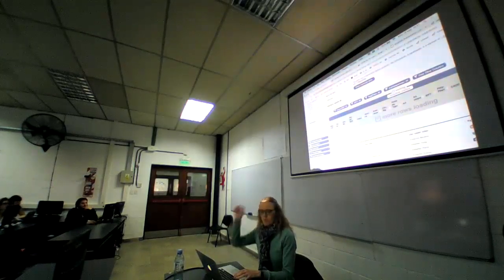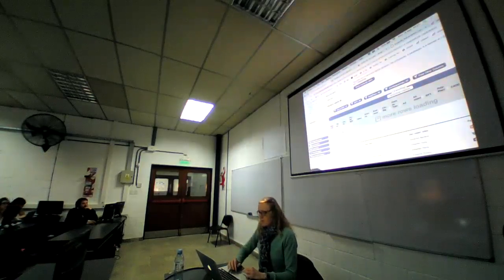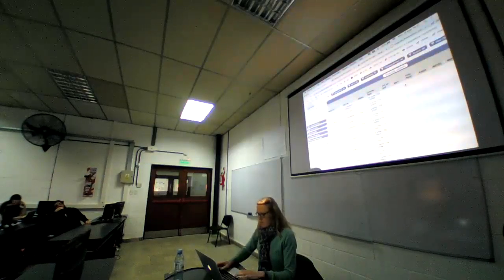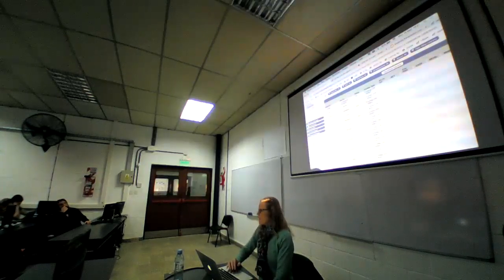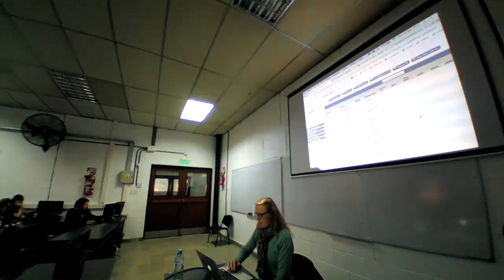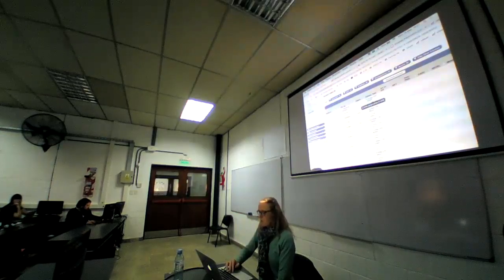Let's see if that loads in a moment, otherwise we will go somewhere else first. Okay, we'll go somewhere else first. I've preloaded a page with a... now it's loading. Okay, so this table summarizes all the variants in the gene with our variant ID in the first column, then the location, the alleles, the most severe consequence of that variant, and then towards the right, pathogenicity predictions. We can't see any results for these variants because they're all in the 3' UTR.